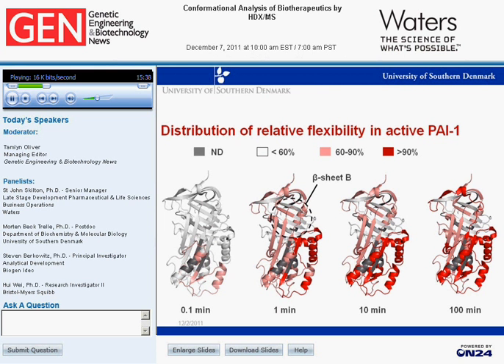Now that we have achieved the basic understanding of the local flexibility, the next step was obviously to move on and investigate the changes in local flexibility when we inhibit the latency transition using our RNA aptamers. Next.